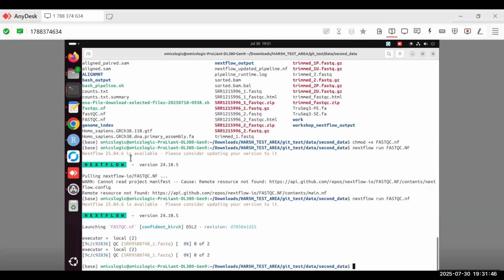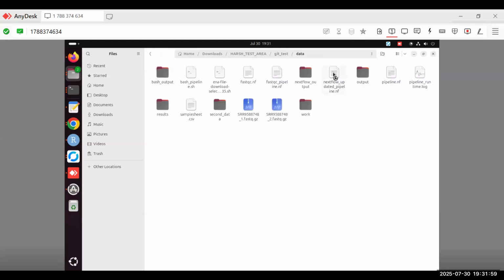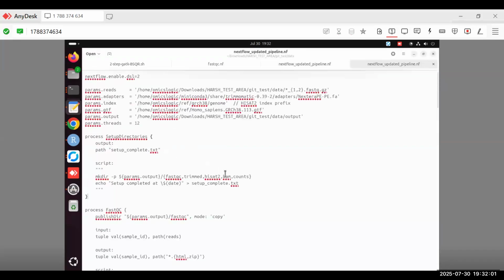Now, we know how we are going to do it. What is the syntax here? So let me discuss with you the detail. This is the Nextflow pipeline that we have. It is going to have a similar kind of syntax, but now here along with the fastq, we have all the tools present and all the parameters for those particular tools over here.